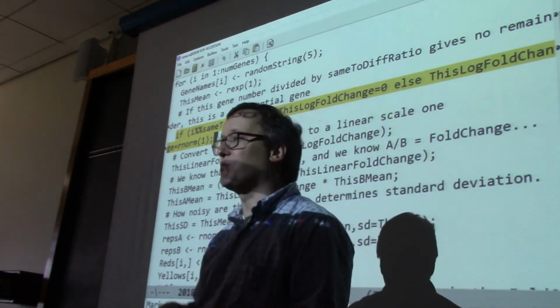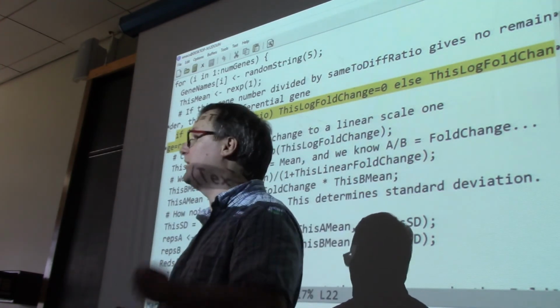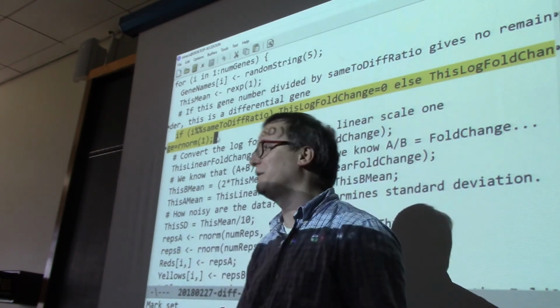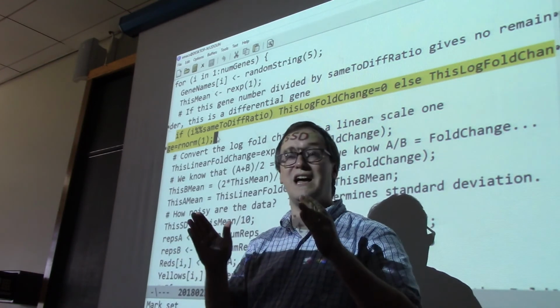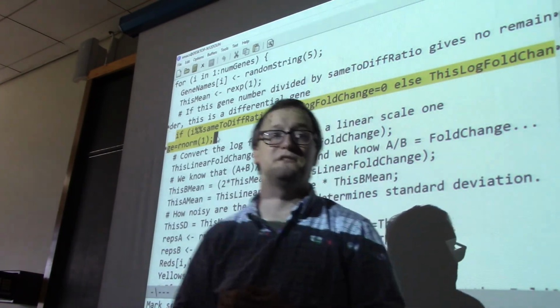Okay, well, we can just walk through it. When we have the value 1 and we divide that by 10, we get a remainder of 1. If we have 2 divided by 10, you get a remainder of 2. You run 3, the remainder versus 10 is 3. This keeps going until you hit 10. As soon as you get to I equals 10, and divide by 10, you get a remainder of 0. So that's the first time you get a false.